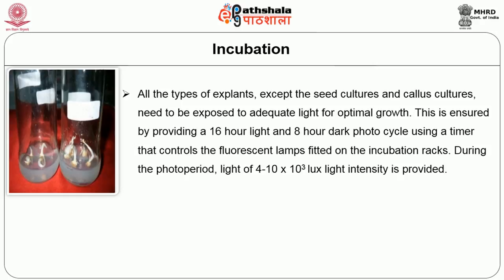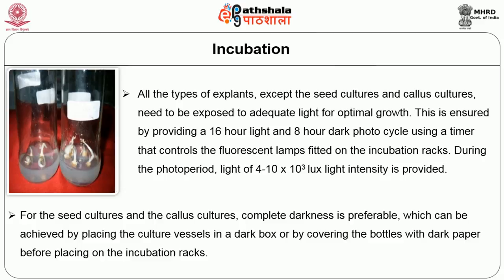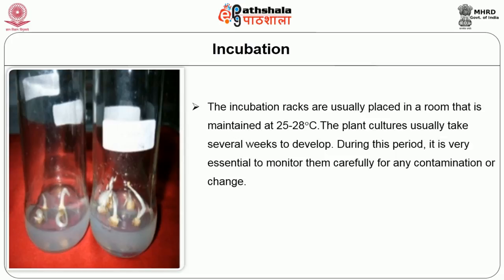During the photo period, light of 4 to 10 × 10^3 lux intensity is provided. For the seed cultures and the callus cultures, complete darkness is preferable, which can be achieved by placing the culture vessels in a dark box or by covering the bottles with dark paper before placing on the incubation racks. The incubation racks are usually placed in a room that is maintained at 25 to 28 degrees centigrade.